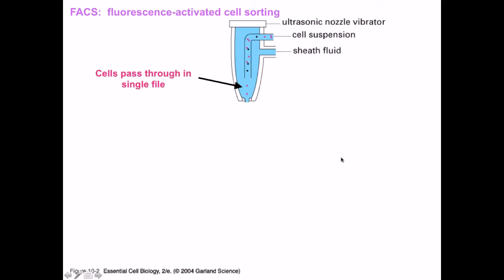Now, the instrument is very complex, and my professor at Stanford who invented it had a team of engineers working with him that helped bring together a lot of different things. One of them is cell sorting and flow, and the other is mixing that up with cytometry. Usually there is a chamber called a nozzle, and in the nozzle you have two different fluids that are mixed together.